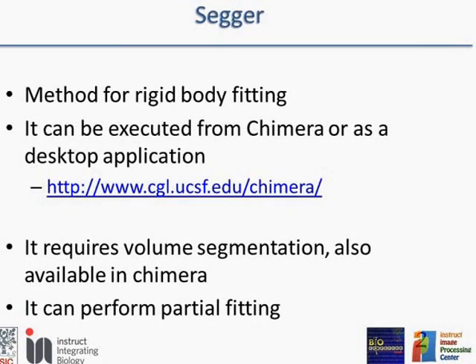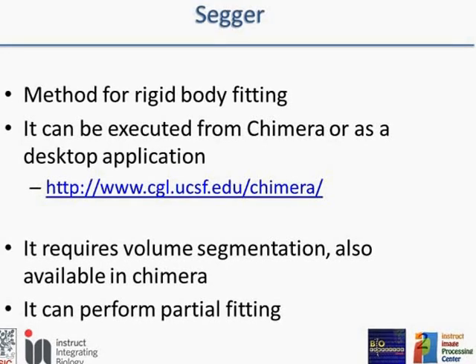Okay, another tool that you can find in Chimera is Segger. In this case, the method is performing rigid body fitting, not multi-body, and we will explain the difference. It can be executed from the Chimera desktop application. Here it should be the link to the Segger webpage.